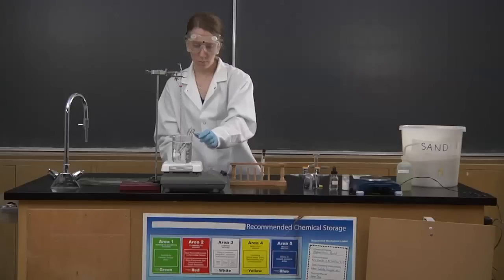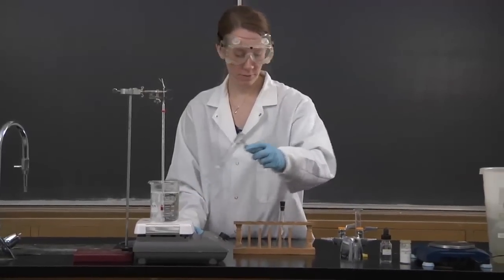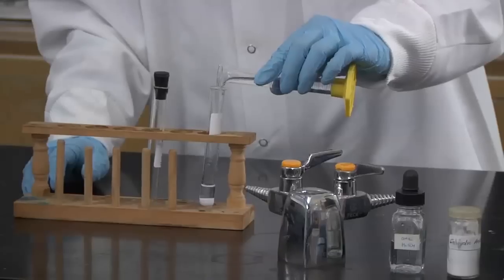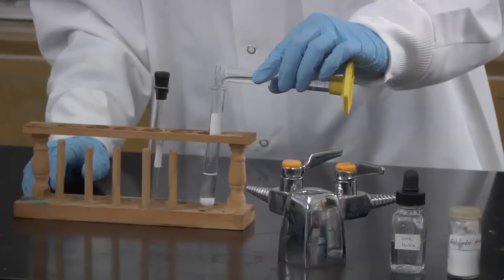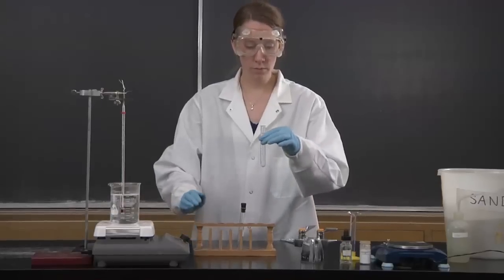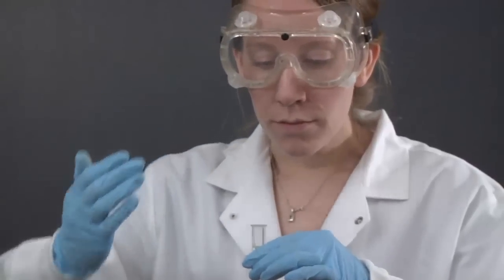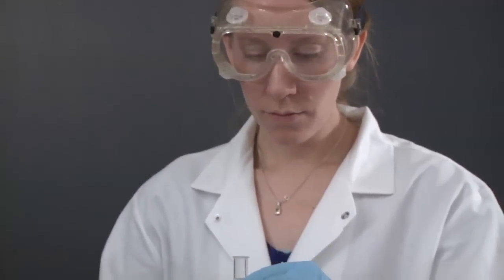Ester synthesis is a relatively slow process, even with the addition of an acid catalyst. You can expect the reaction to take anywhere from 5 to 15 minutes. To more easily detect the small quantities of ester produced, water can be added to sequester the water-soluble carboxylic acid and methanol. In scientific investigations, the proper way of smelling a gas is to use the technique of wafting, as shown, to avoid inhaling the gas.